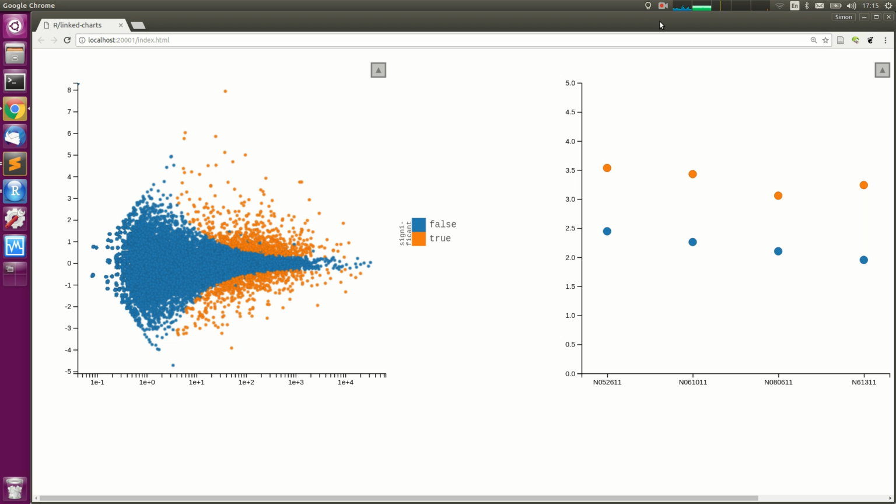So this is how we can use this, and now we want to learn a bit more about these genes. There are two ways to go about this. One is to say we have thousands of genes, and probably only the top ones are the interesting ones, and the rest is just incidental findings. The other way is to see all these genes and ask what they probably all have in common. In practice, what most people like to do is the latter.